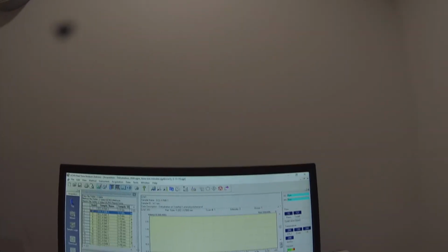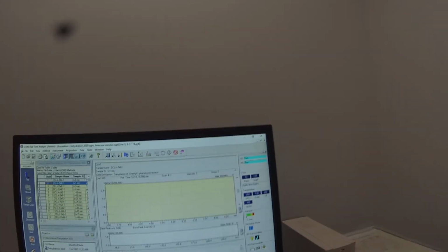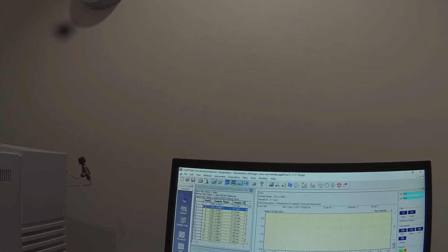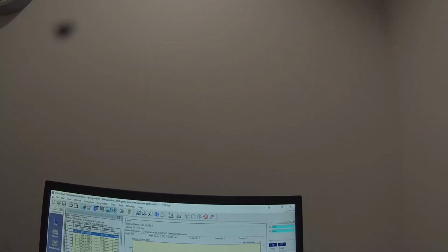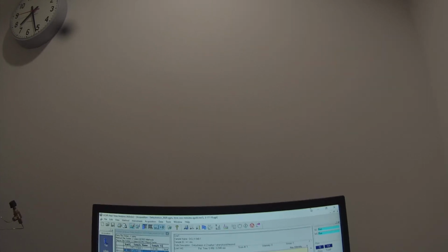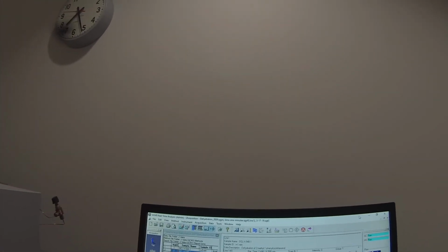And again, I'm not sure if those are in. No, it's crashing again. Okay, well, something's wrong. Don't know what, but I'll figure it out. It may be pointing at the wrong folder for where the library is. That's possible.